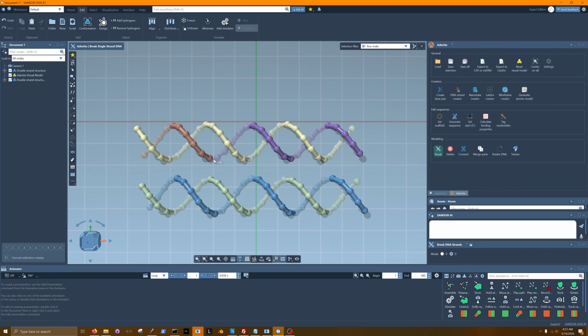Now, so I counted 10 on the 3', and I think it's like a fence post thing. On the 5' you should count 11. So we'll go 1, 2, 3, 4, 5, 6, 7, 8, 9, 10, and I want to cut here. Yes. Okay, good. Now we'll try to do that over here.